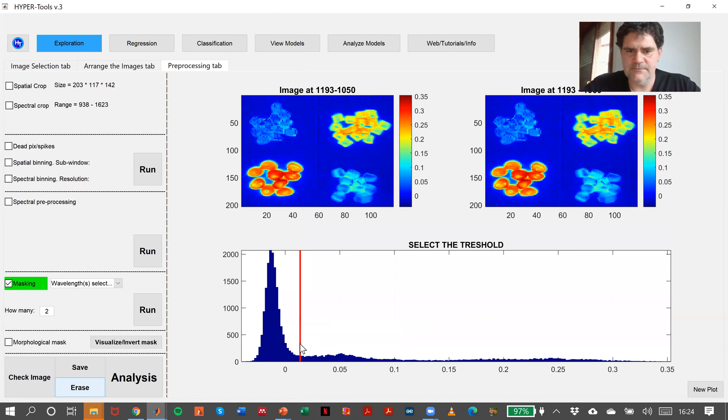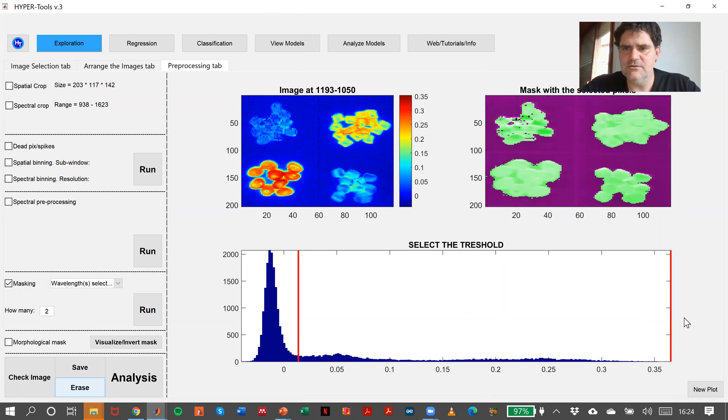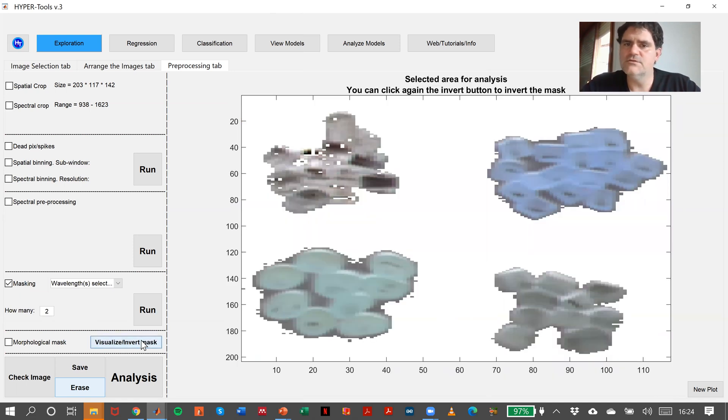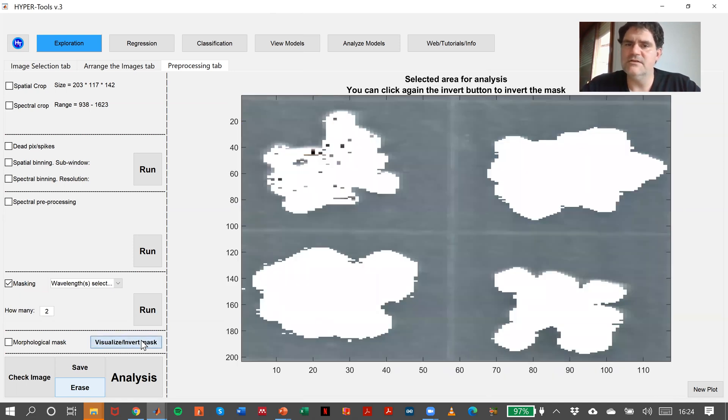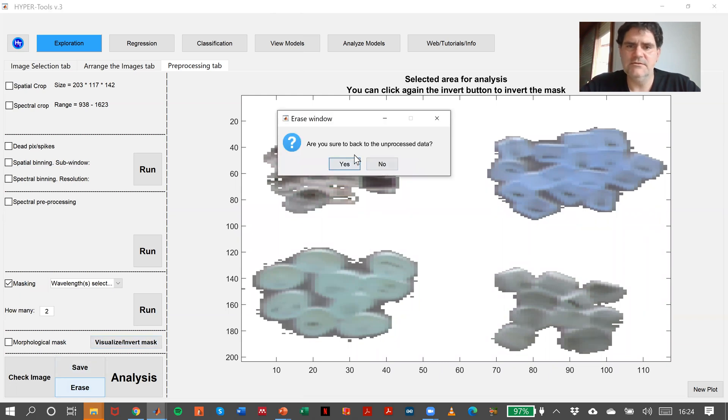So we can select with our mouse from here up to the end, we can click outside, and look, now we could see the plastics well selected as well. Erase.